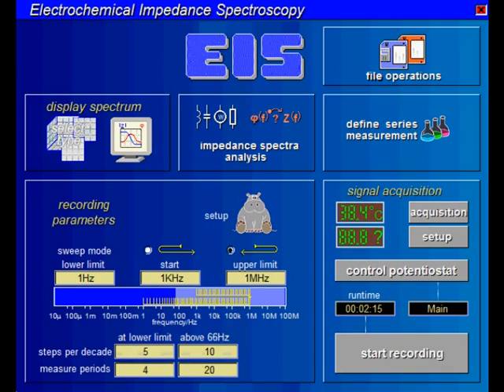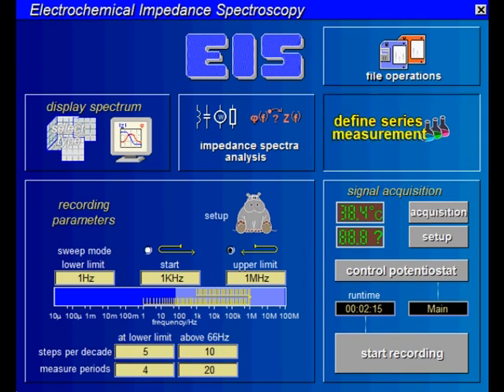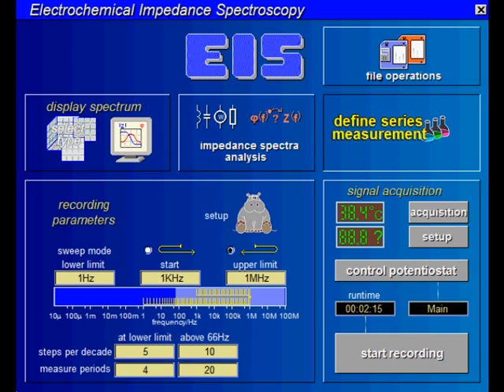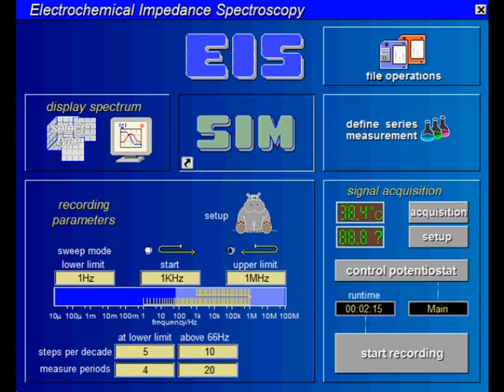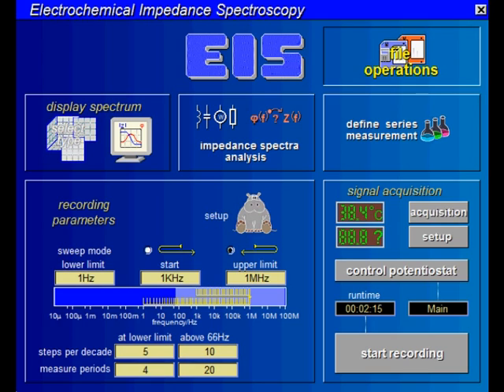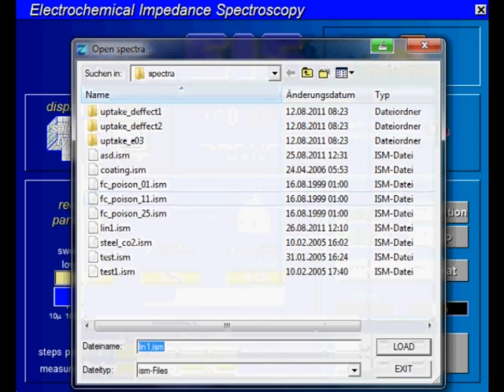Now let's go back to the EIS main page. TALES allows you to acquire additional values like temperature, pH value, or others if the optional cards or NetVI devices are installed. On this page you can set up series measurements over time, potential, current, or other parameters. Using an RMUX card you can automatically scan through up to 64 cells. This button leads you directly to the analysis section of the TALES software called SIM, where you can create and fit equivalent circuits.